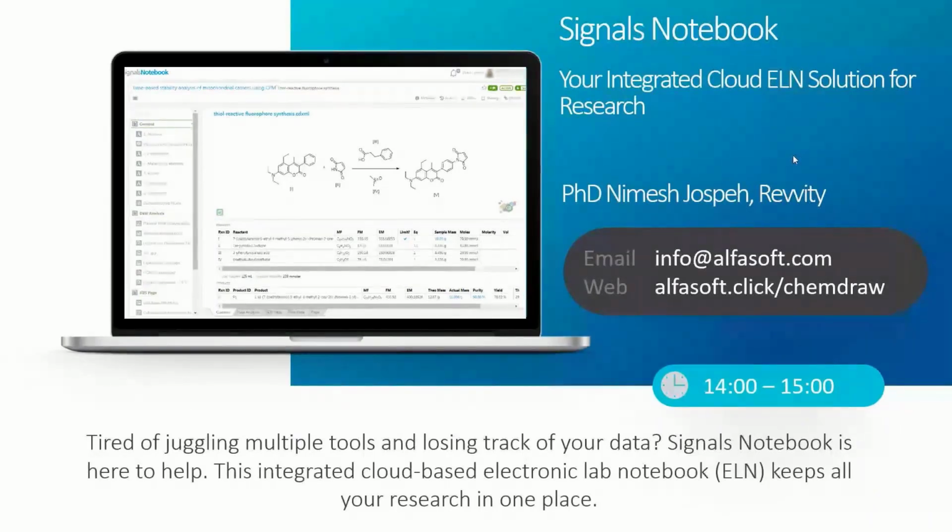The majority of actions that users take in the Signals graphical user interface are available in our public API, which can be accessed through Swagger, which is available from the user interface to the administrators. So yeah, Signals is not just the notebook; it's the whole platform, which is far more capable for taking your data through that whole discovery cycle.